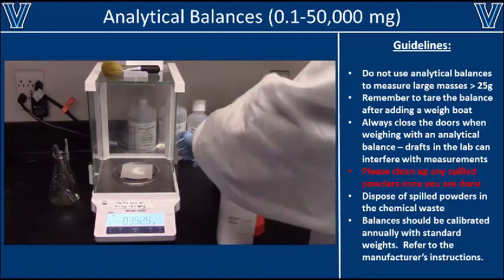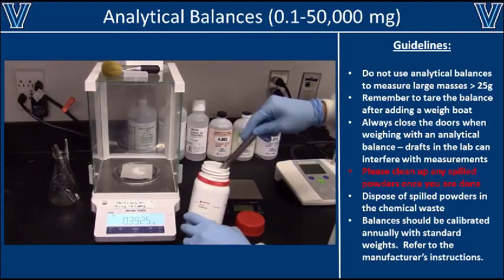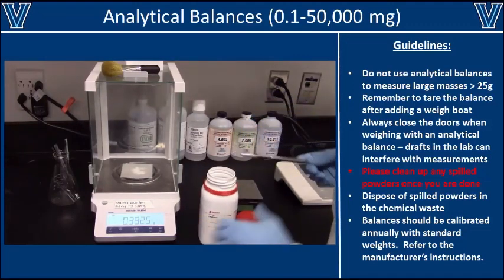Check the exact weight by closing the doors on the analytical balance and giving it a few seconds to stabilize. As long as your spatula is clean, you may return any excess chemical to the original bottle it came from.